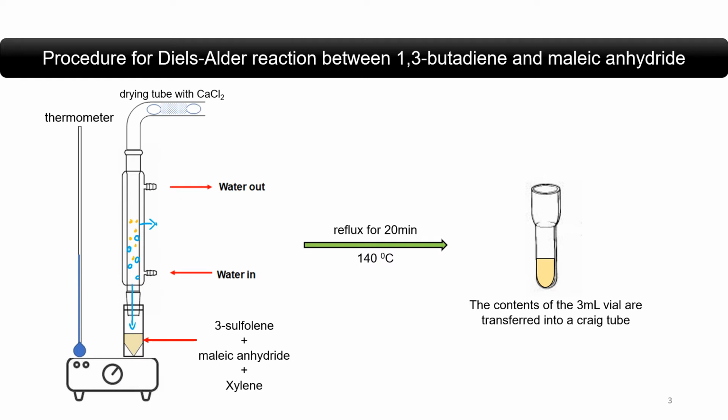This type of performing a reaction, we call it refluxing, and it's a way to maintain the reactant volume during a longer period of time when we have to perform it at a higher temperature, like in this reaction, and we want to allow like 20-30 minutes for this reaction to occur in order to see some product formation.